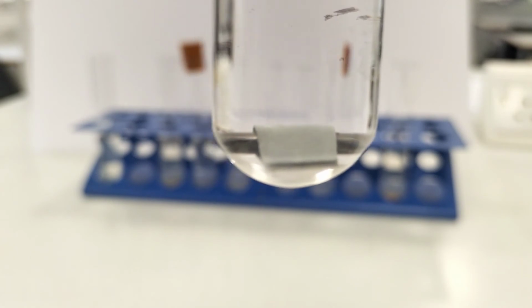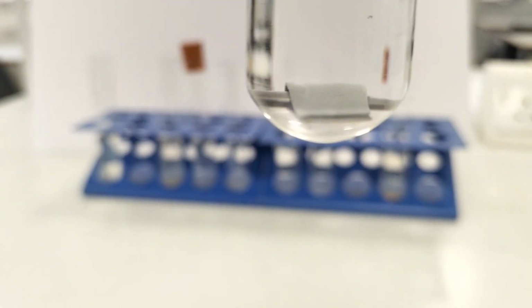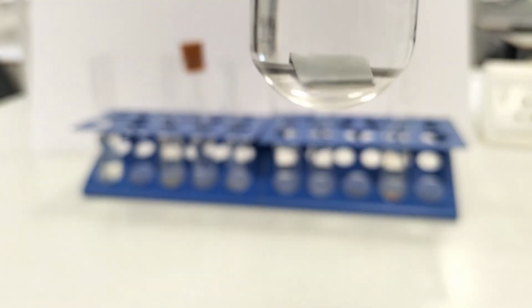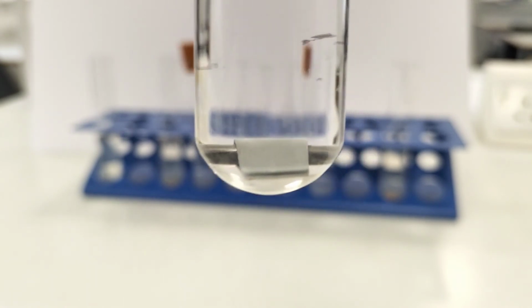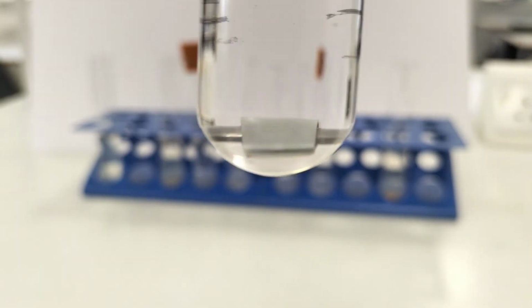So this piece of zinc is protecting the iron atoms all around it, and until it's been completely exhausted, it will continue to do so. And in fact, zinc might be a better metal to use than magnesium because its slightly lower reactivity than magnesium might give it a more prolonged sacrificial protection compared to the magnesium. So zinc is an ideal candidate as a sacrificial barrier.